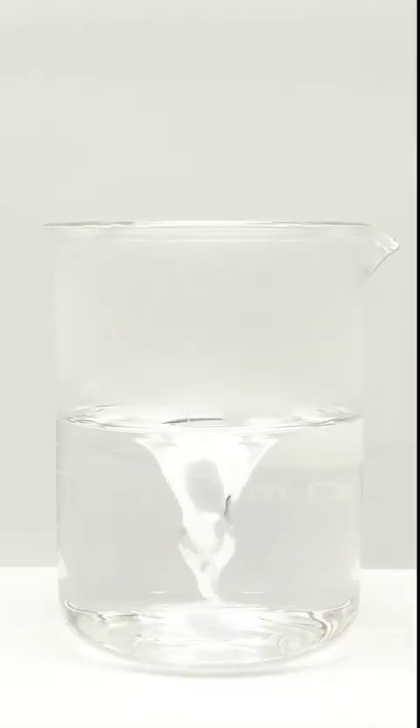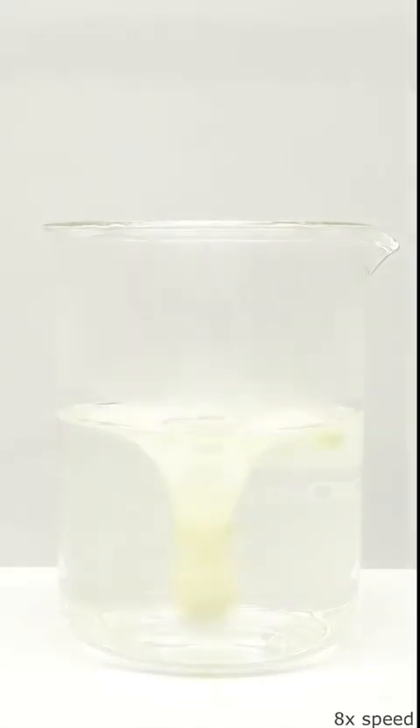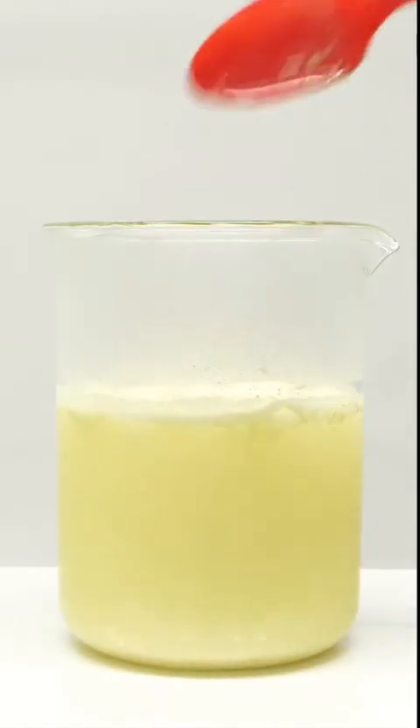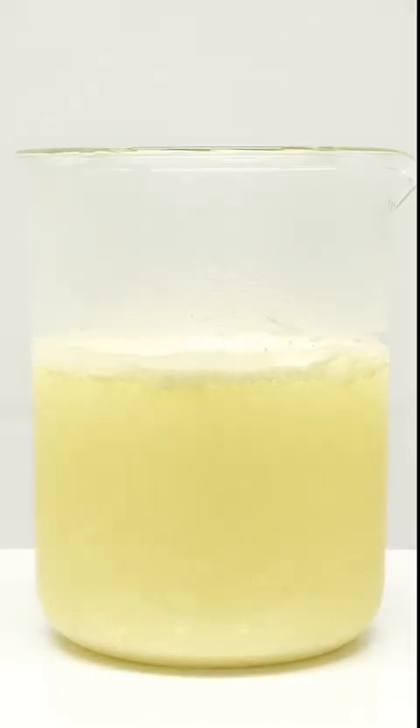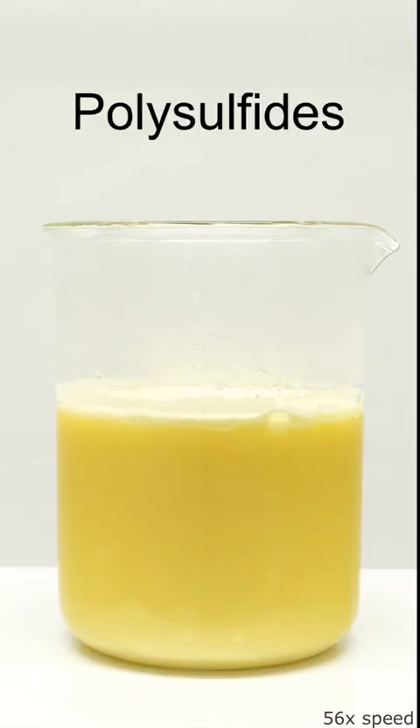It now seems pretty good, and I can start adding some sulfur. I'll do it slowly to not mess up the stirring, and in total I'll add about 30 grams. At first it doesn't seem like much is happening, but the sulfur is supposed to be reacting with the sodium hydroxide. The sulfur should be turning into a mixture of molecules called polysulfides, which are soluble in water.